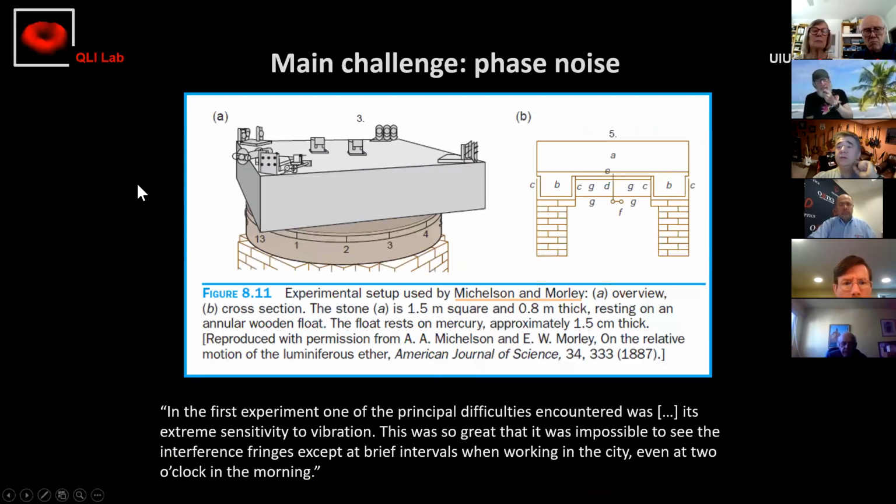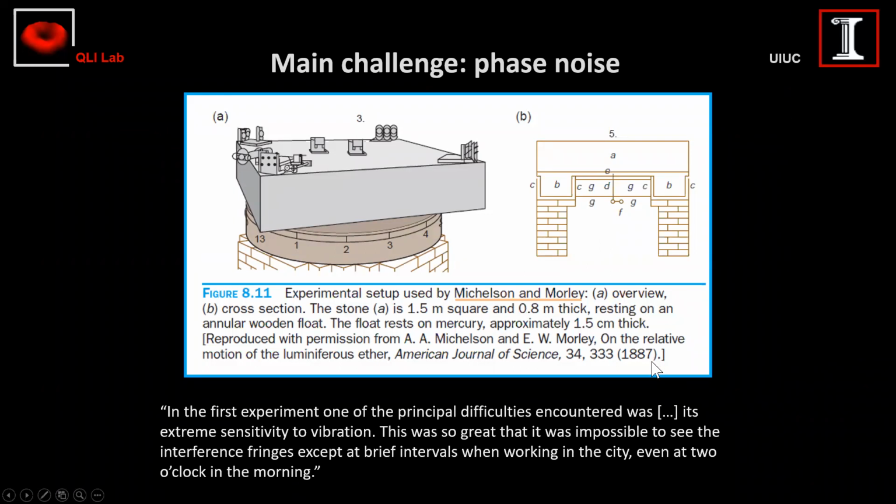No matter how you do the experiment, the main challenge, and in my opinion, the reason we don't have quantitative phase microscopes everywhere in every single biology lab, is really noise. And this, for some of you who are familiar with the Michelson and Morley experiment from 1887, they were trying to detect the presence of ether by measuring the speed of light in 2 perpendicular directions. Basically, this Michelson interferometer and what we are doing today is measuring the exact same thing. Phase shift. That's how they tried to detect the presence of ether.